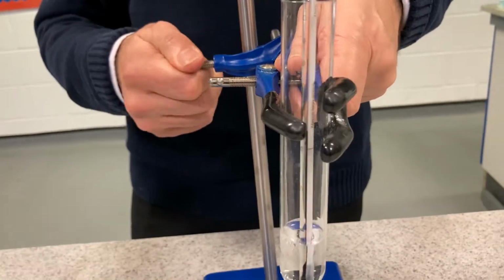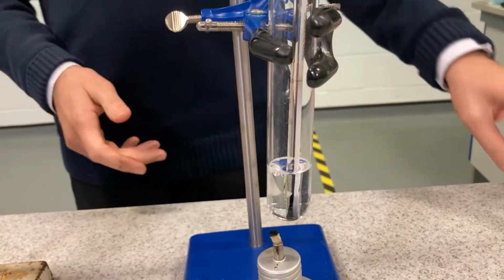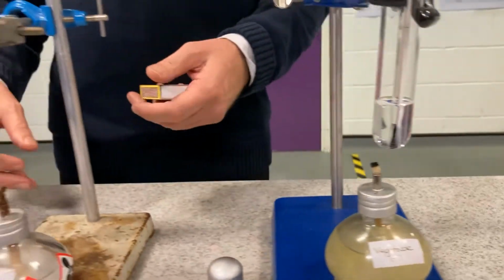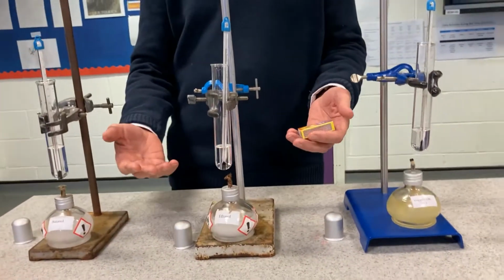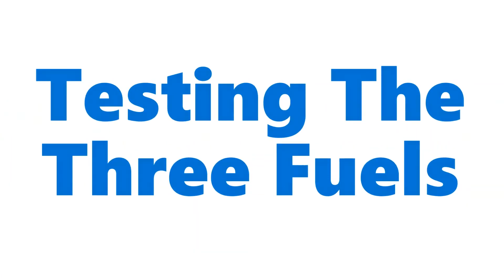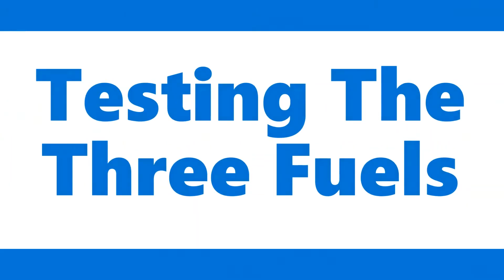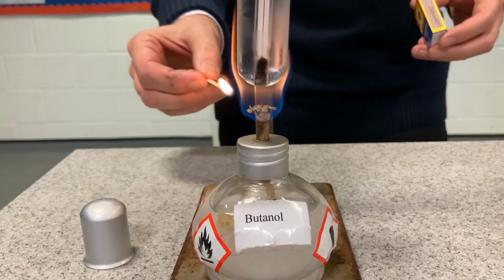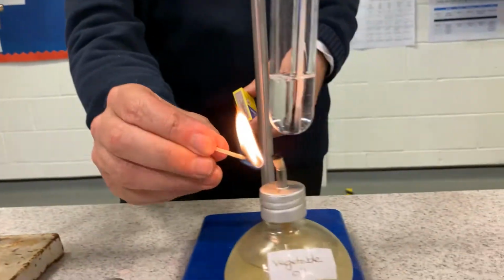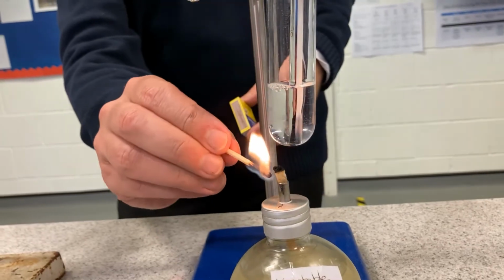Move that down slightly. Right, so again, to be a fair test, we've got to burn the same amount. We could measure the amount of fuel and we could measure a certain number of grams. I think the easiest thing is if we just measure it for a minute, we'll run it for a minute and then we'll see the change. So that's lit. 1, 2, 3. We'll time that for a minute.